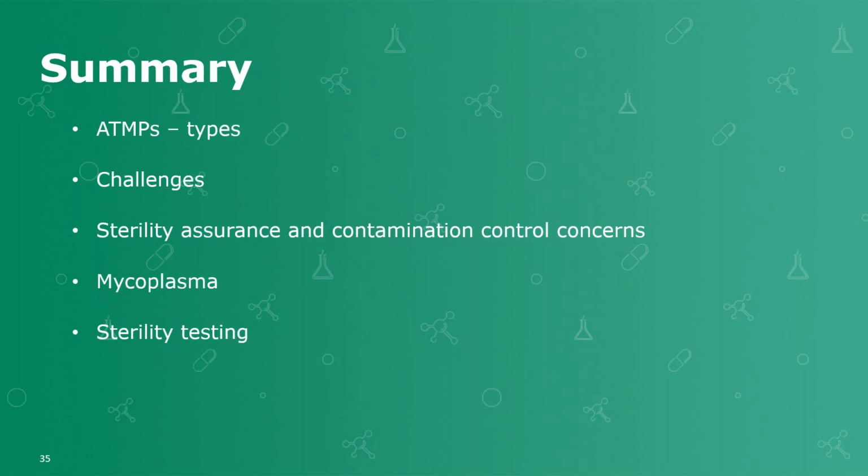But we have looked at the emergence of these patient-specific therapies and some of the new challenges they present, and the way that regulators are driving a special wave of GMPs, and that's an acknowledgement that the sterility test may not always be available. So we're much more reliant upon other control measures and modifications around things like visible particulates as well. Okay, so thank you very much, and I'll pass you back to Annette.